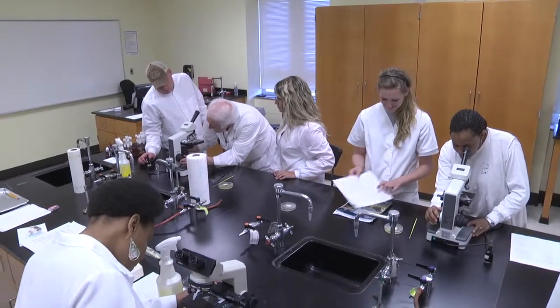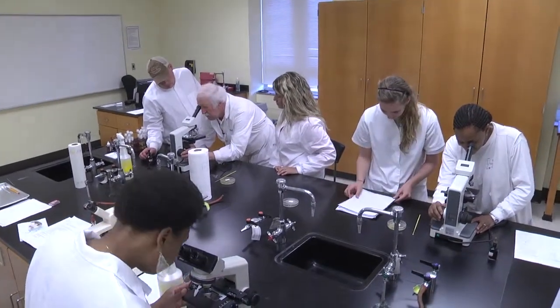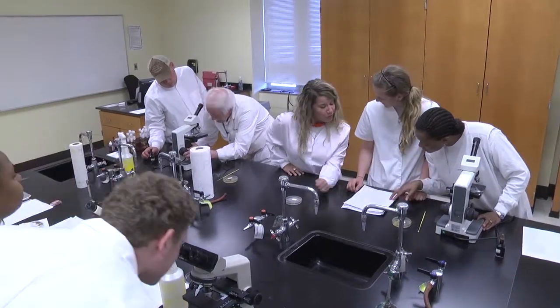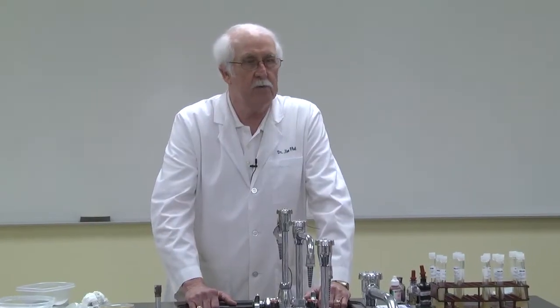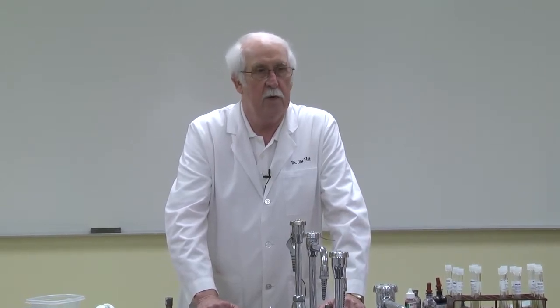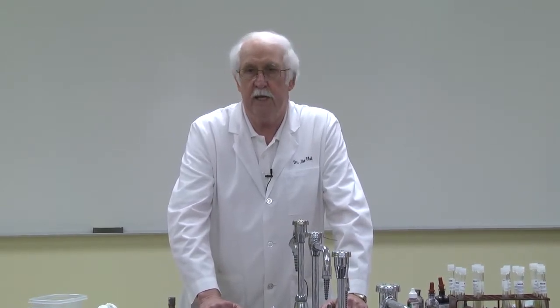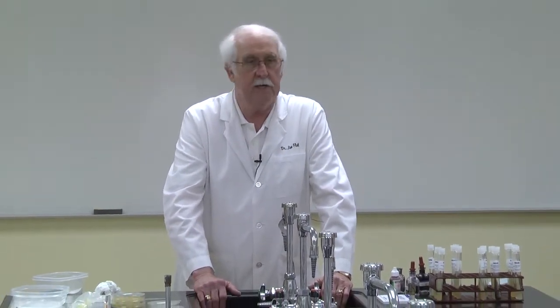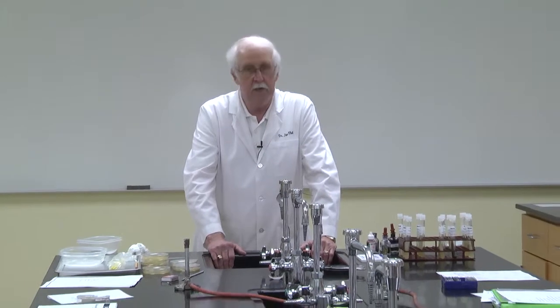You have the exercise in front of you there that we'll be doing. The next thing you would do, you would scrub the tabletops as I've done up here. Then you would get the microscopes. These are compound microscopes. They're top of the line, and so you can go up to 1,000 diameters with these. Get well organized before you start. Make sure you have all the materials that you need, and then do the negative stain.